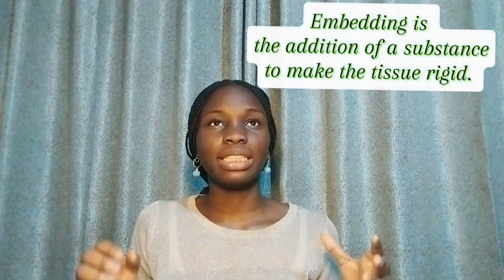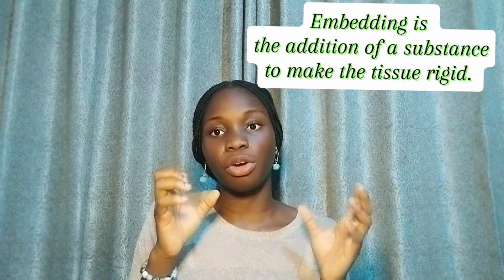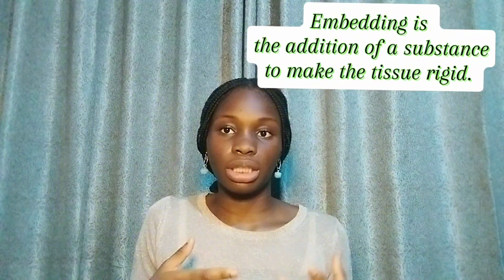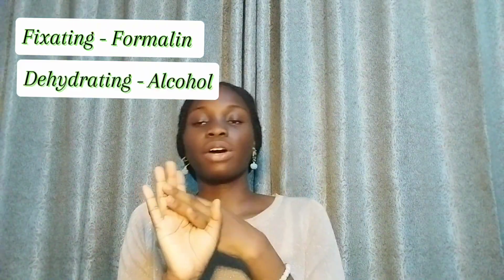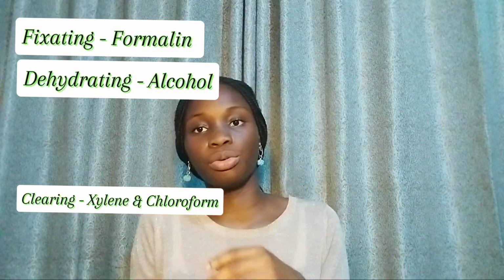So the next step is called embedding. Embedding means the addition of a substance so that the tissue becomes rigid, the tissue becomes fixed. So how do you do that? Like we said, for fixating, you use formalin, which is 10% formaldehyde. For dehydrating, you use alcohol. For clearing, you use a substance soluble in paraffin, which is xylene or chloroform. The next step tells you why you have to use a substance soluble in paraffin, because to embed, to make the tissue rigid, you need to use paraffin wax.